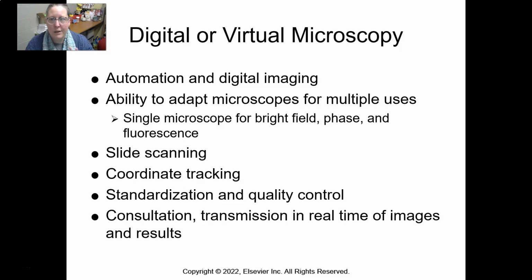This is done in a lot of other realms, digital imaging and consultation, especially our friends in radiology, who have been doing this for a long time. There are also some of these being done in hematology, where we're taking pictures of cells for records, etc. So we're really expanding the use of the digital microscope for better record keeping and tracking and history of the specimen, etc.